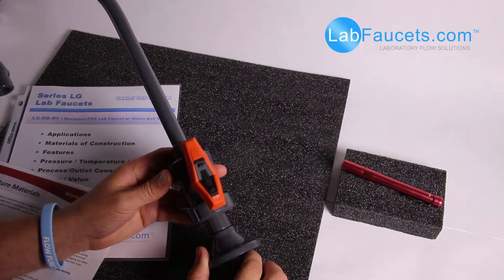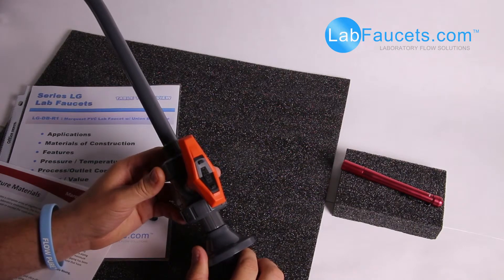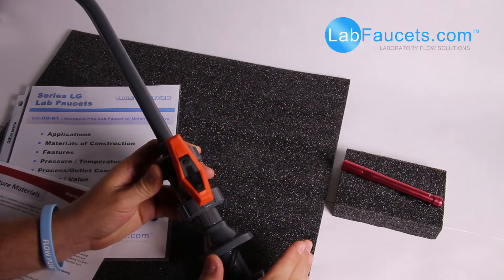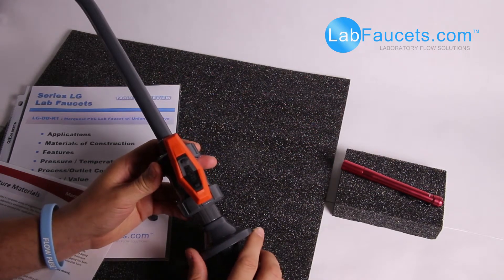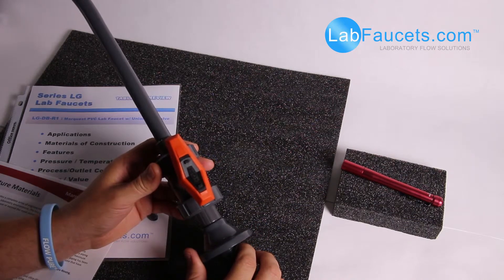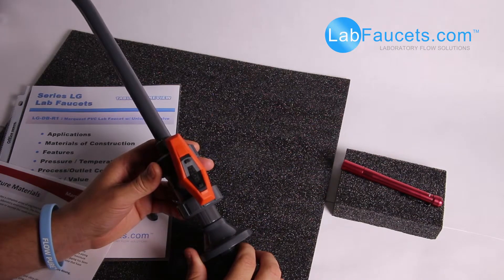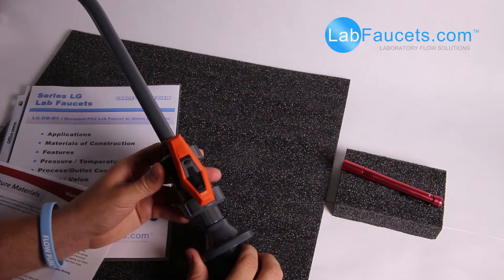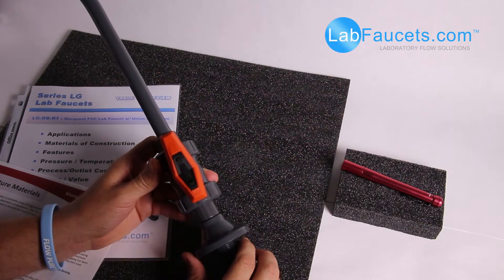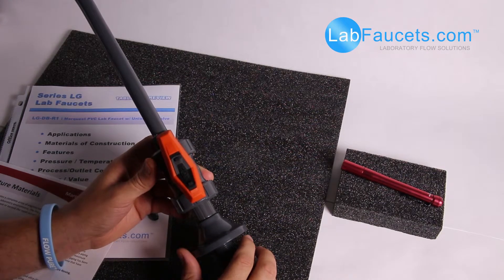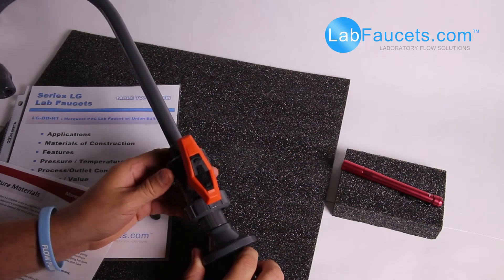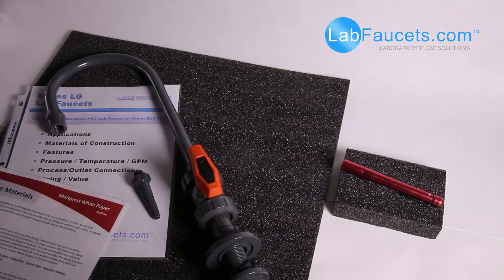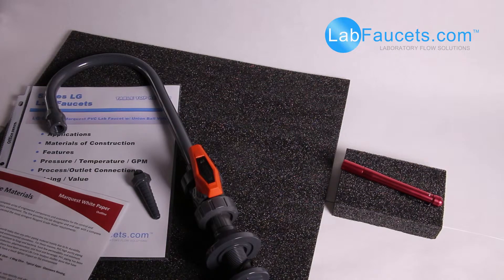PVC is a very good material for DI water and certain chemicals. So this will dispense certain chemicals and lower resistivity water. When we get up in higher resistivity, like type 1 DI water, that water is very aggressive and can soften the inner wall of PVC over long periods of time and cause some particulate or leaching. For typical lower grade DI water applications, PVC is going to do just fine. If your application is more critical and you need something of higher purity, then moving to natural polypropylene or PVDF would be our suggestion.